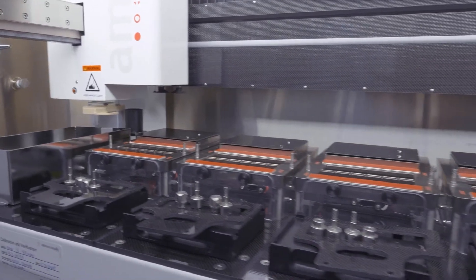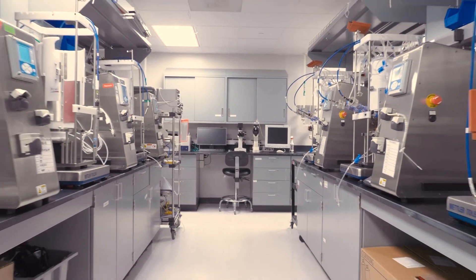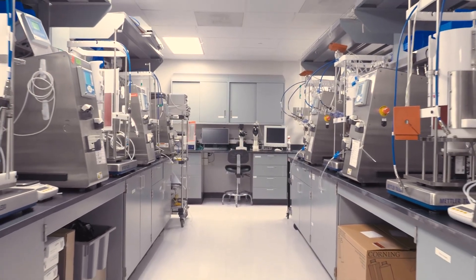You can run 48 micro vessels at a time, and each one holds about 15 mils of culture. So you can do DOE design and study 48 different conditions, and then we use our JMP analysis software to assess what the best parameters are going forward from that study.